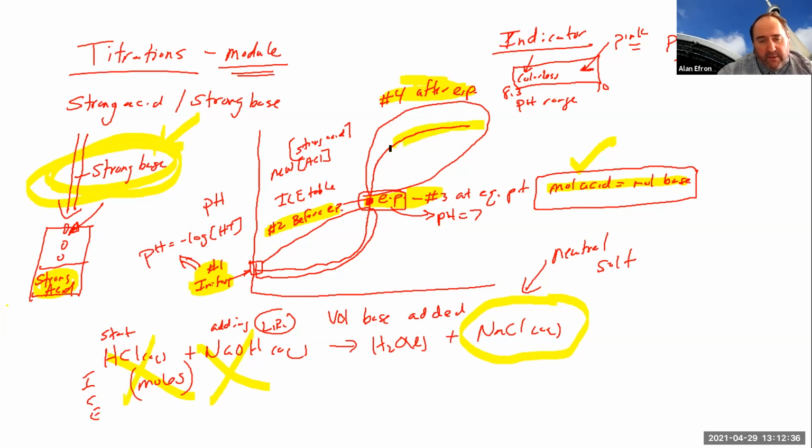And that's why we also see that jump in the equivalence point as we get there. And then after it, it continues to rise. And that's because, again, as we go past the equivalence point, we have now just used up our acid. So we're just dumping base, just dumping hydroxide in there. And then we should start to see the pH increase a lot at some point.